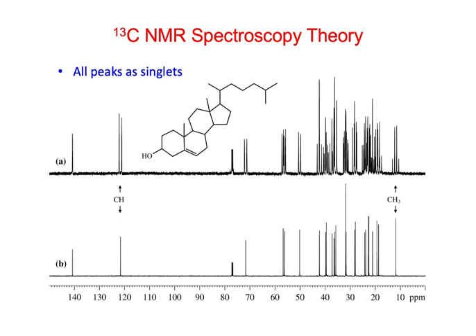So we get better resolved peaks, and because C13 is insensitive, taking a multiplet, a quartet, or a triplet and putting it all into a singlet means the peak is going to be much higher, and you can get by with less signal to noise.